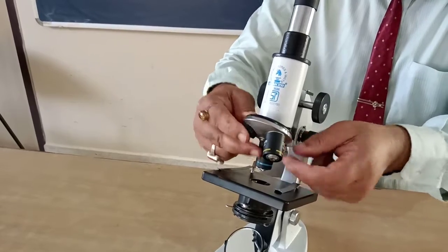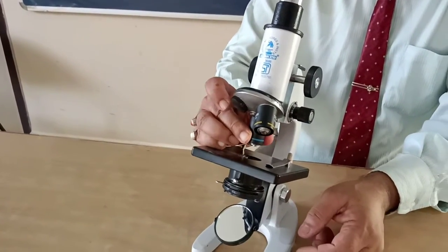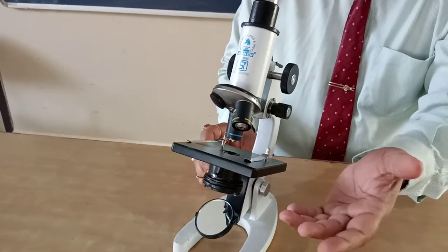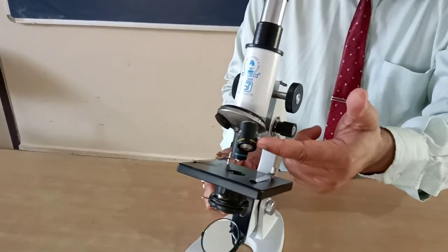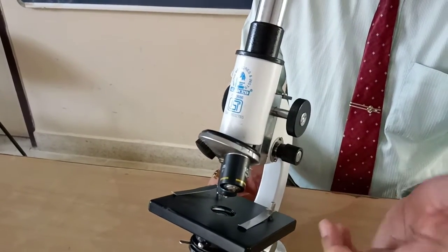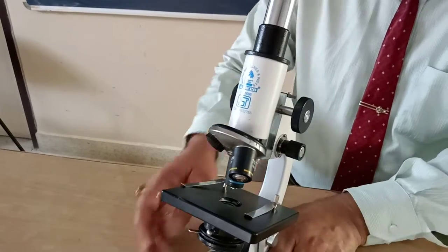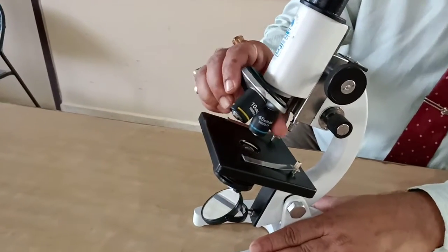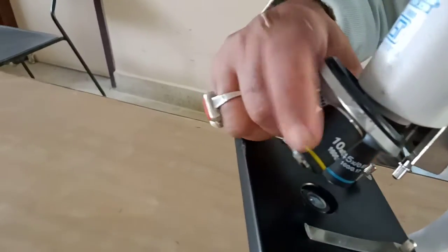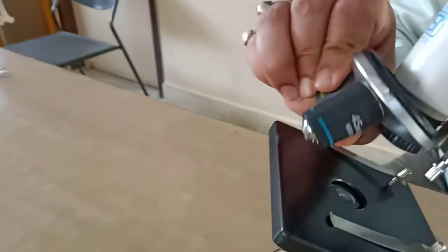Now it has points for fixing three lenses of different magnifying power. Maybe 10x, 45x, 60x or 100x. X means that many times it can magnify the object. So here it is 10x. You can see this 10x low power. Then this is 45x.